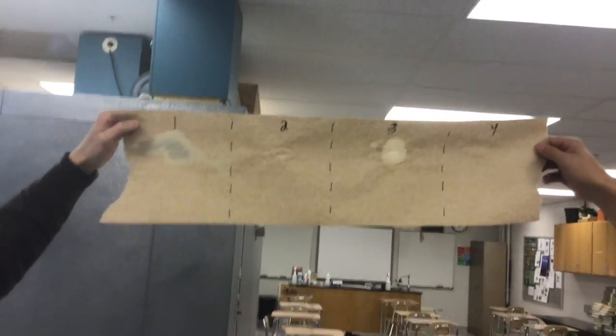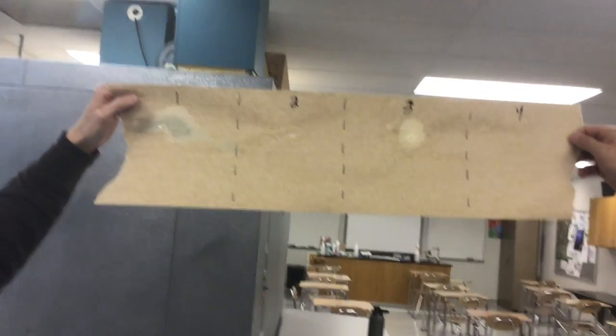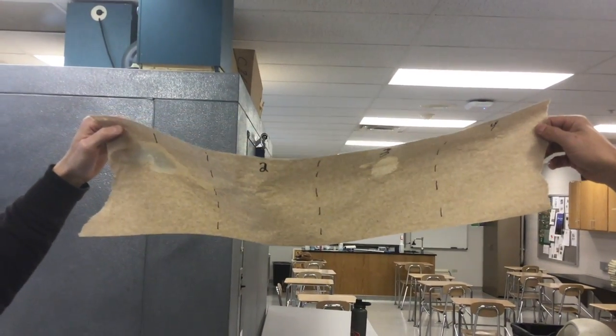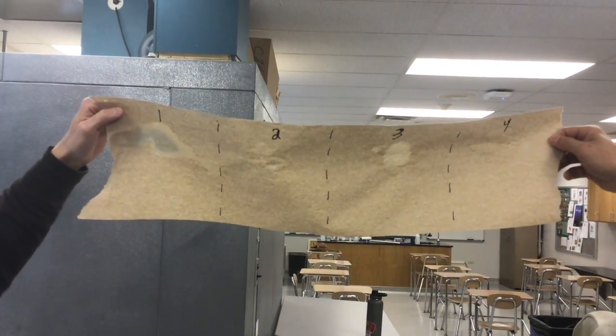Okay. I would say 1 and 3. 1 and 3 appear to be transparent, and 2 and 4 appear not to have lipids in them. So you should be thinking about which one of these unknowns would be fed to herbivores and which one of these unknowns would be fed to carnivores based on the results that we see here.